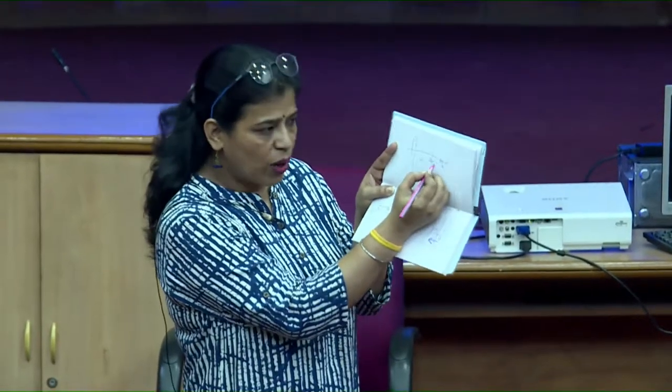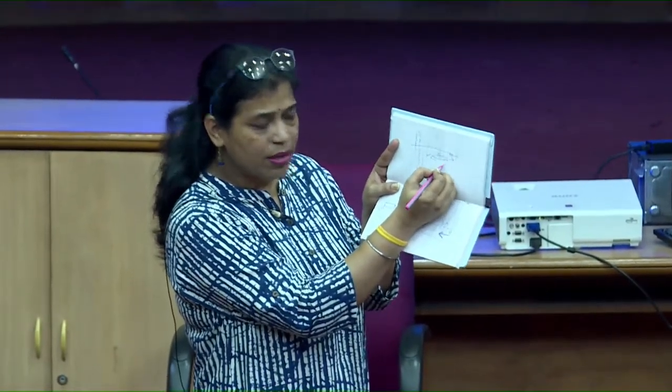But by chance, let's suppose your input sequence itself is such that it is showing some dimerization, then it is better you select some other primer, and you can do that manually also. Let's suppose this is a particular region where your primer has been designed. This is the region, right? So you are getting self-complementarity, let's suppose, at this area. What you can do now is avoid this region and design the primer manually. Just shift 4-5 bases, avoiding that particular region, towards another side and you will get a good primer.